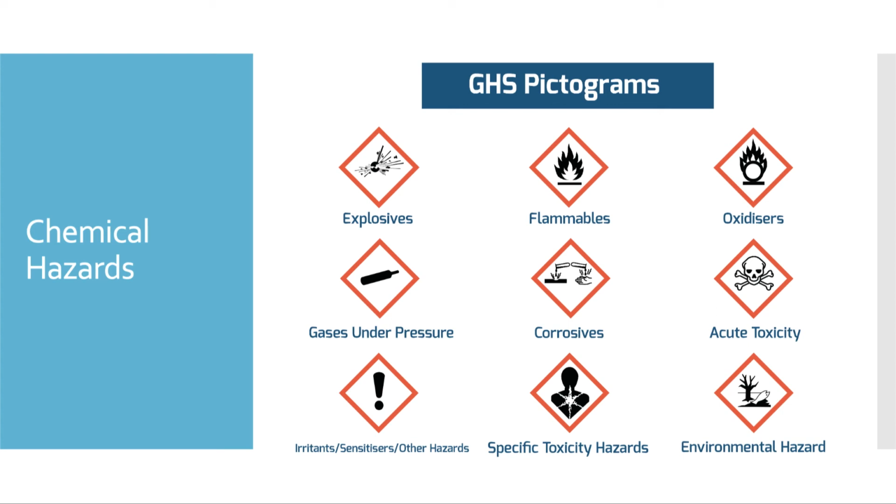Ammonium nitrate itself does not burn, but it is an oxidizer. So there was reportedly a fire in a building near the ammonium nitrate, and the ammonium nitrate became hot. It began releasing oxygen, and then that caused kind of a chain reaction. Things spiraled out of control, and the next thing you know, there was this massive explosion.